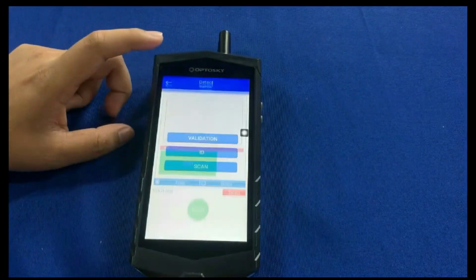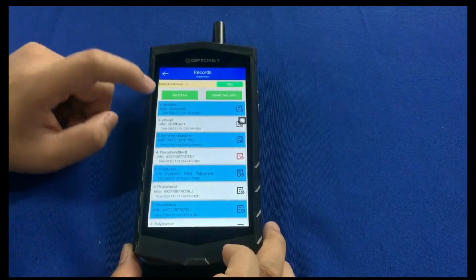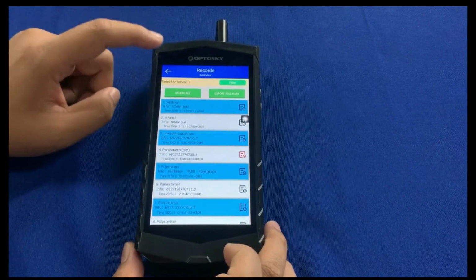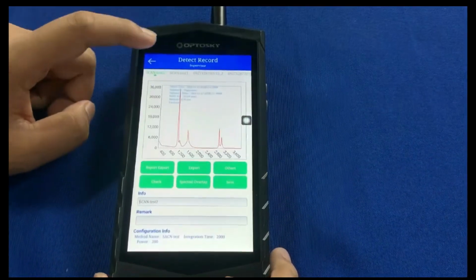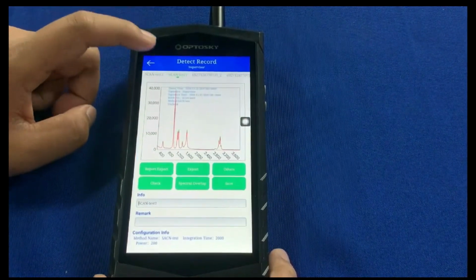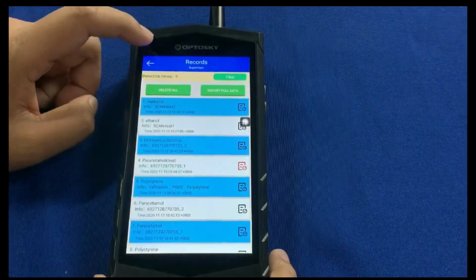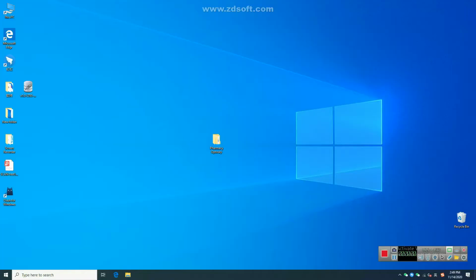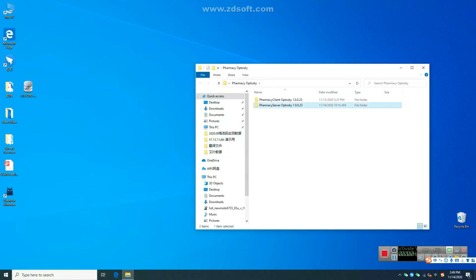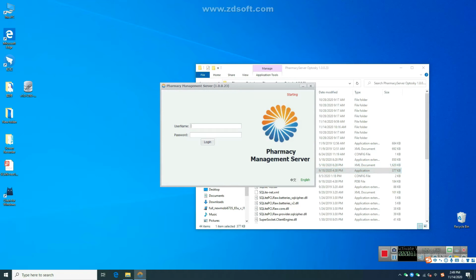And we can check the history record of the methanol and the ethanol. Check the historical record. And then we need to move to the next. Let's perform test case 9.